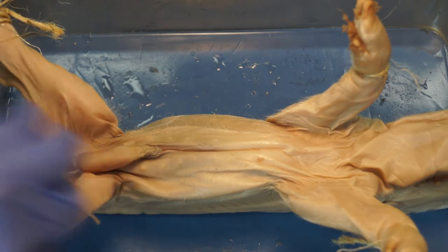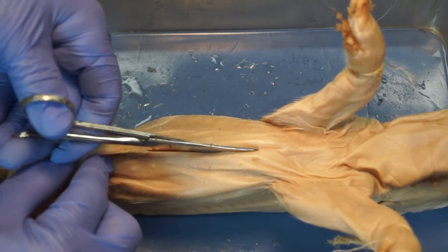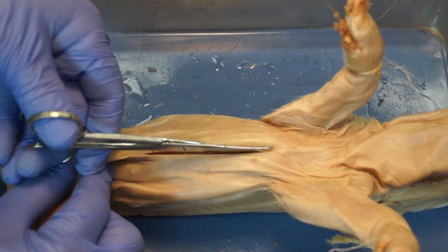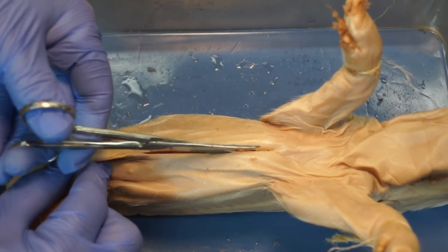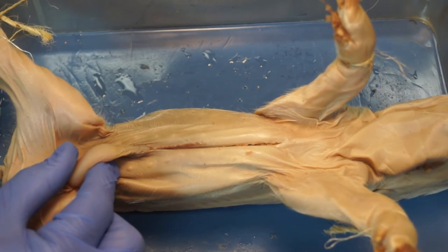To be sure that you've gotten through there, you can hold up the umbilical cord and put your scissors inside and even cut up a little towards the thoracic cavity, cutting through the ribs — but we'll get into the ribs later. And that's the first cut.